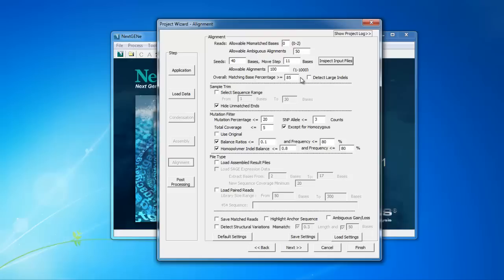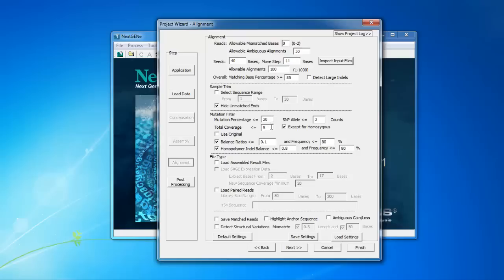Some other settings you may want to adjust are those under the Mutation Filter heading. These settings determine the requirements for calling variants. The Mutation Percentage setting is the requirement for the percentage of reads at a position with a variant for a mutation to be called. The default value is 20%. For somatic variant detection or any low frequency variant detection, you can adjust this to a lower value, for example, 1%.